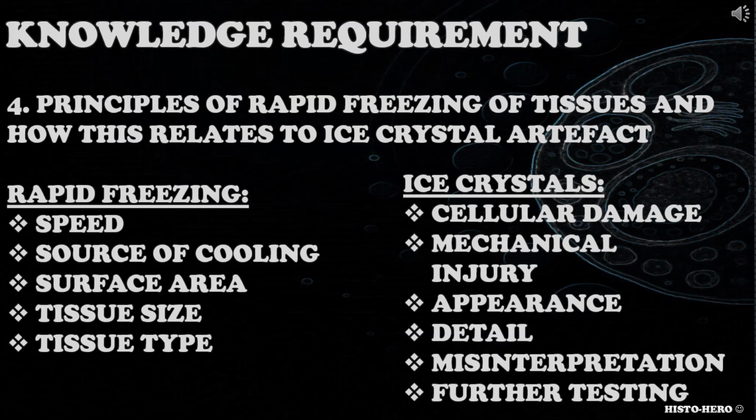How do ice crystals form during freezing and how to prevent it? What affects ice crystal formation? And what tissue damage can be caused by ice crystal formation.